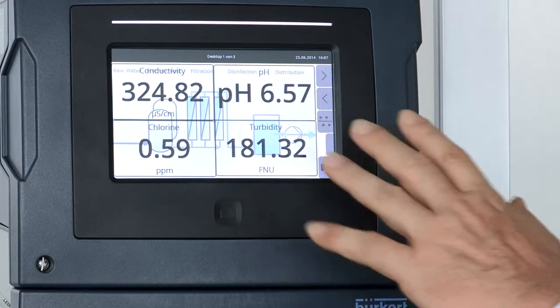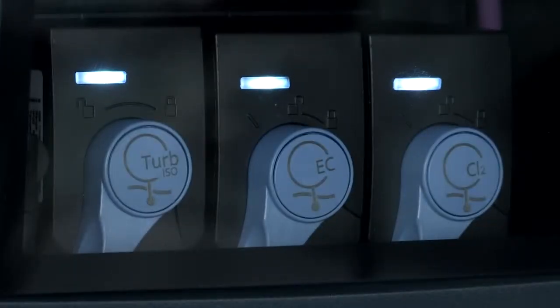Can you tell me a little bit about these cubes — what are the different parameters that the cubes measure? Well, we've got up to five different measurements here: we've got turbidity, pH, conductivity, and also temperature alongside the pH. But we don't have to use them all simultaneously — we can just run a couple and expand this in the future.